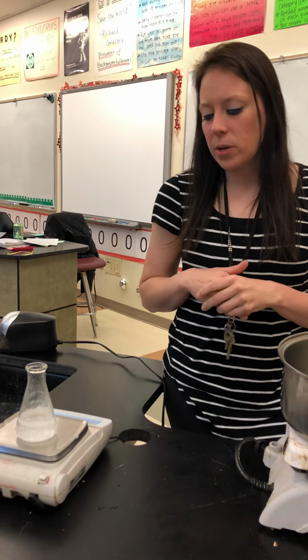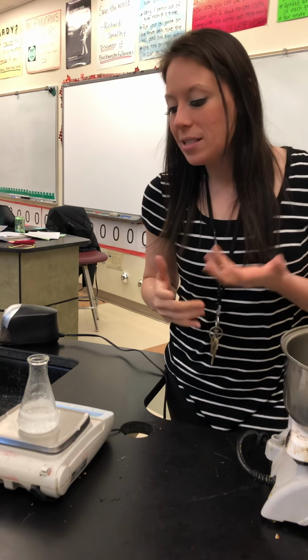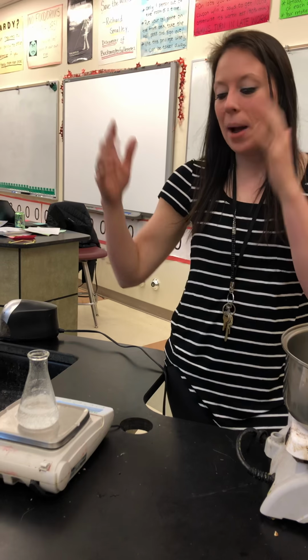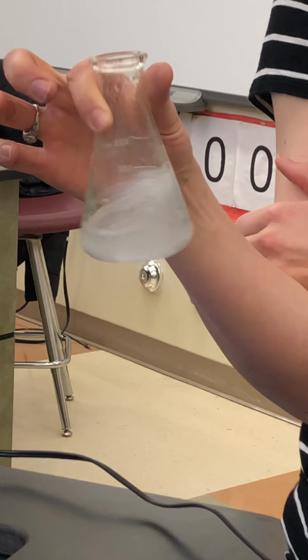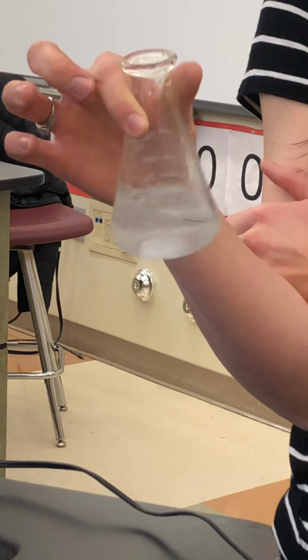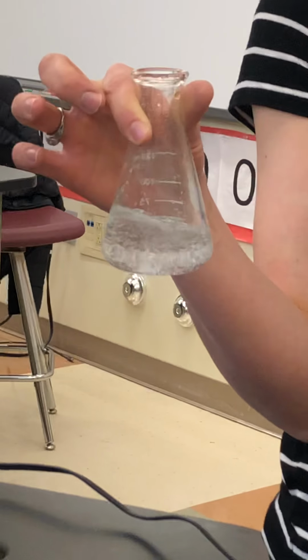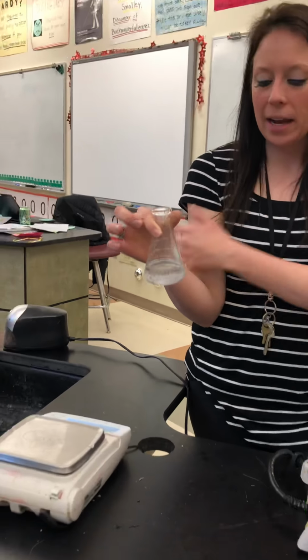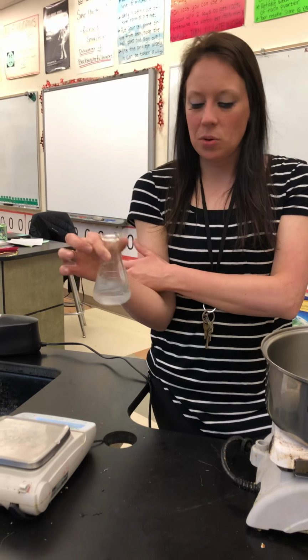So you're also expected to talk about some sources of error in this lab, like why didn't you get the full amount? And you can even see right here that some of the carbon dioxide bubbles actually stay dissolved in the solution for a while, so maybe you didn't allow the reaction to go to completion. Maybe something was up with the way that you massed the tab, like you didn't have a complete tab when you took it out of the package. Was there really a gram of the starting reactant? Things like that you can think about.